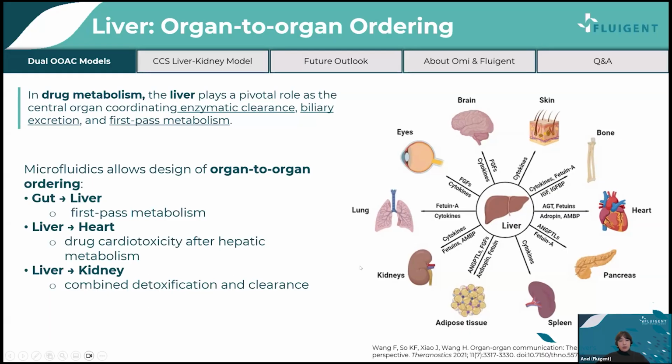Dual and multi-organ models allow this axis to be examined under controlled, isolated conditions, providing insights that static models cannot provide, especially when it involves a lot of communication with various tissues.